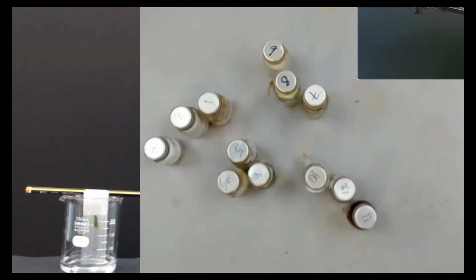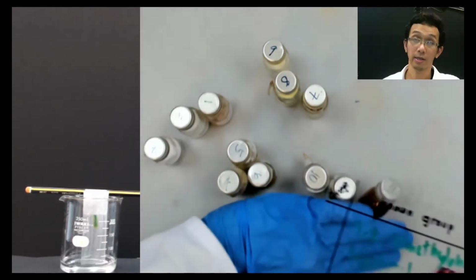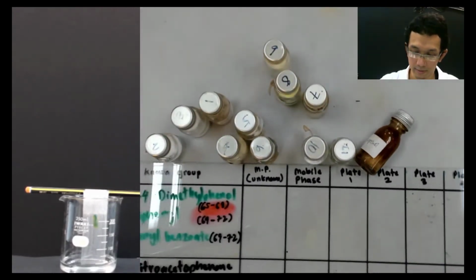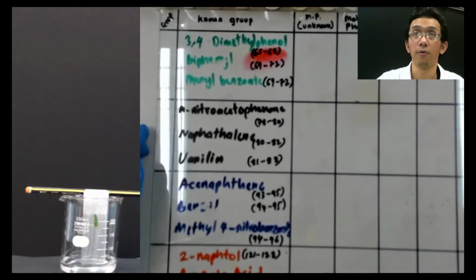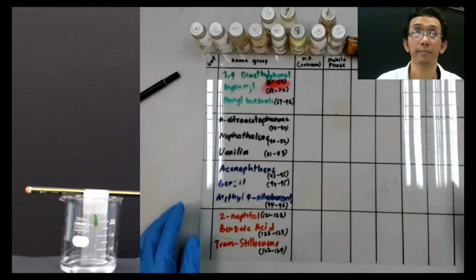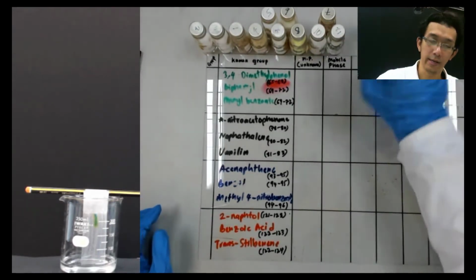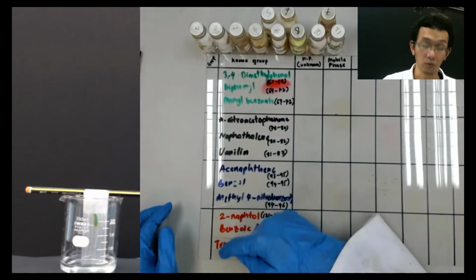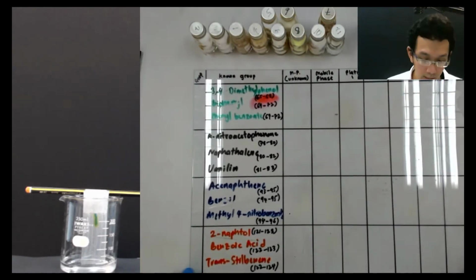To make it easy, I put it here. So like this. Can you see? Let me zoom out for a while. Okay, can you see that? Basically, these 12 samples are all these things: 1, 2, 3, 1, 2, 3, 1, 2, 3, 1, 2, 3. So they have 12 of that. Can you see that? Is it okay? Yes, sir.